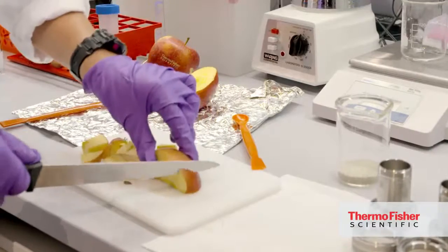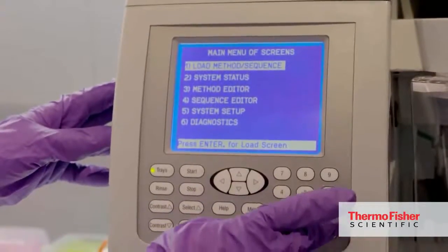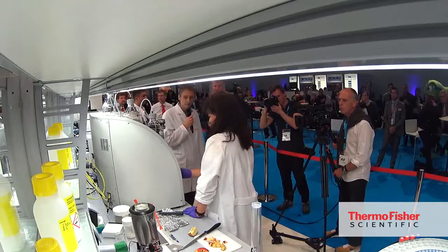What we've done here during the live lab is a full sample preparation. We just took some apples and we demonstrated here for the audience a whole method procedure, how we clean up a sample and what is really the workflow for pesticide analysis.